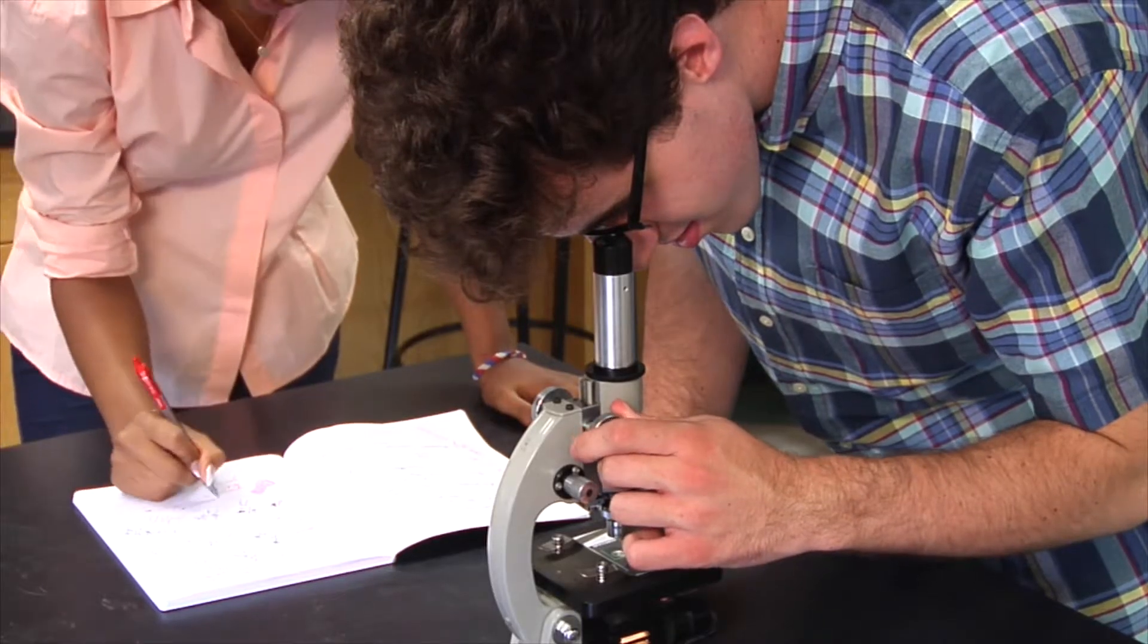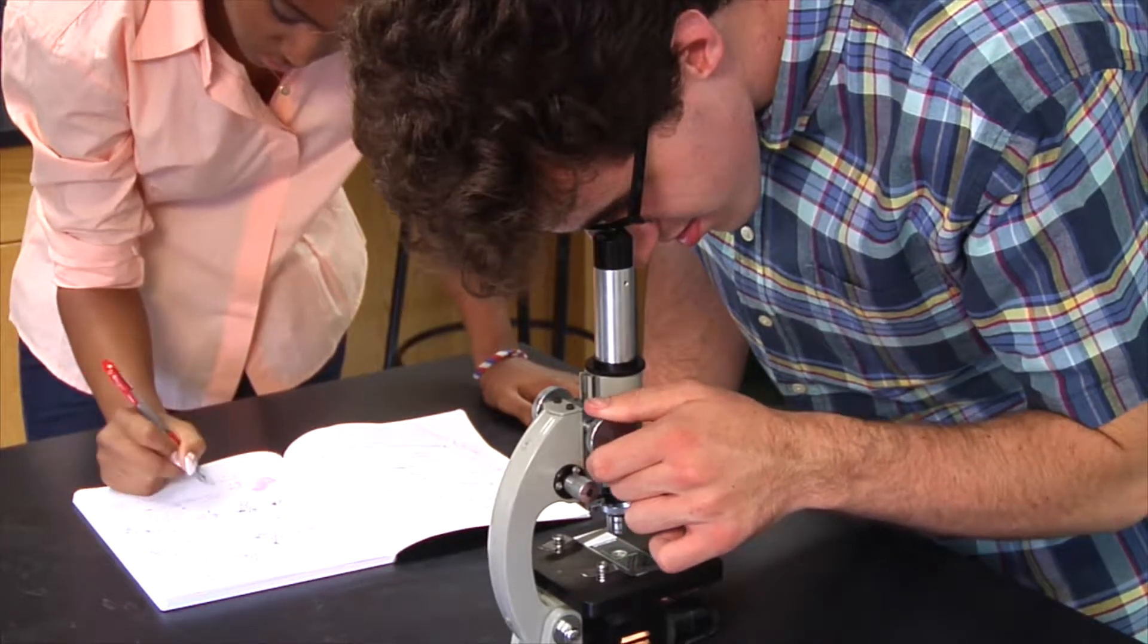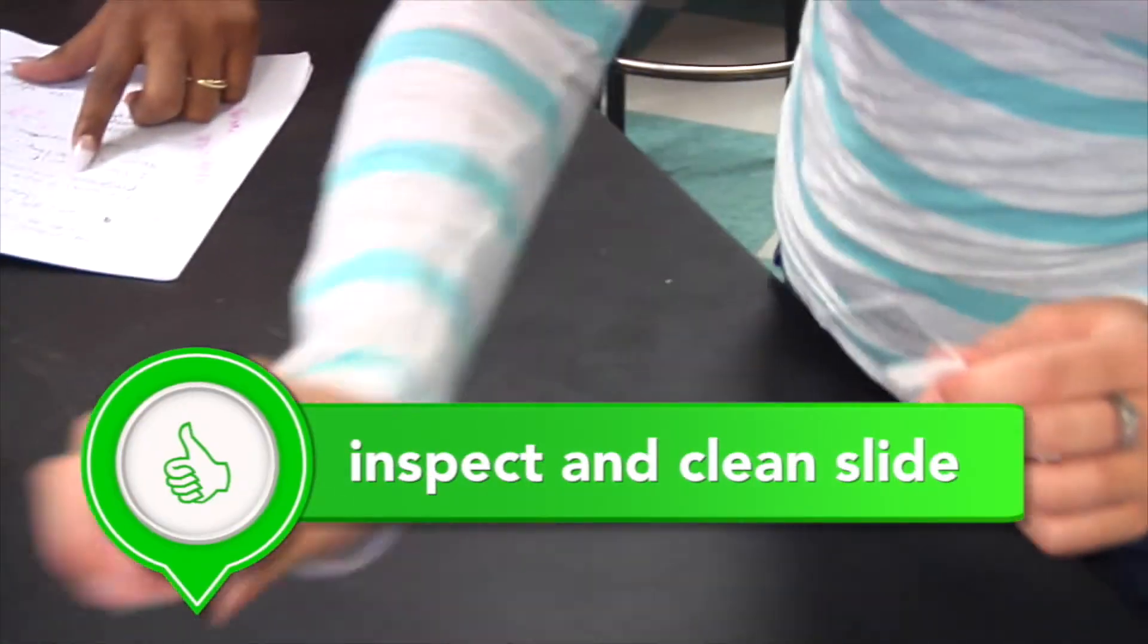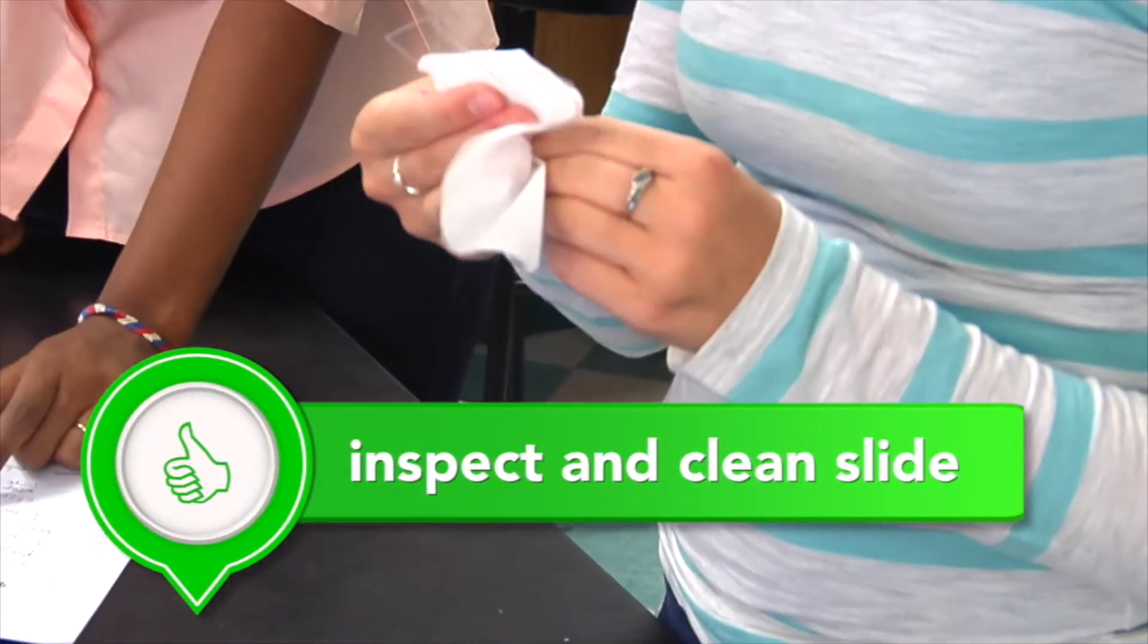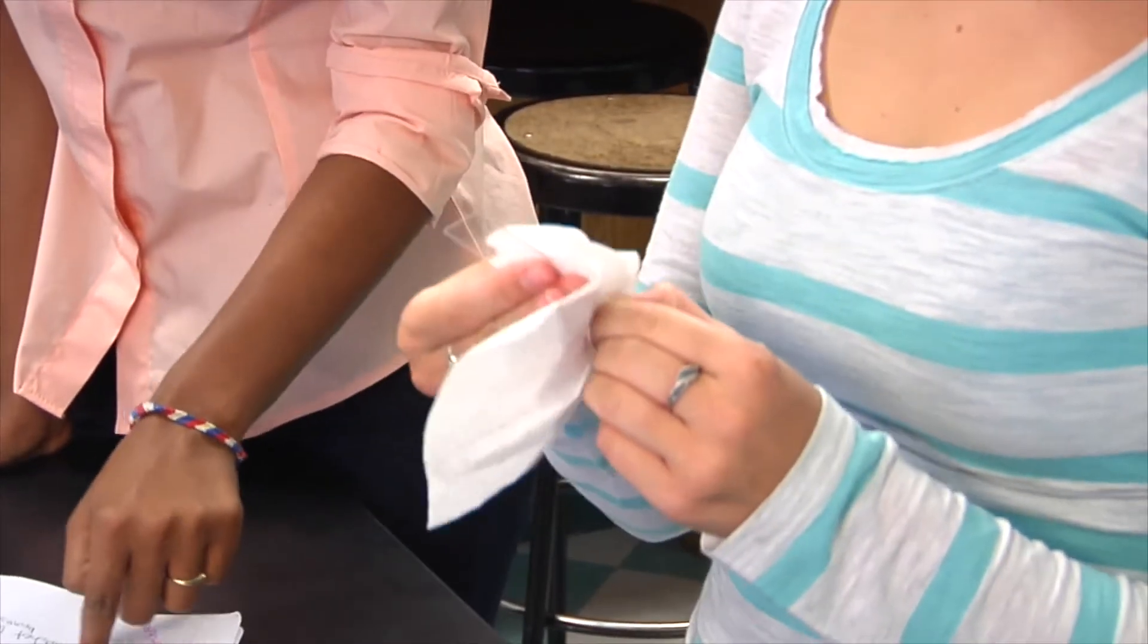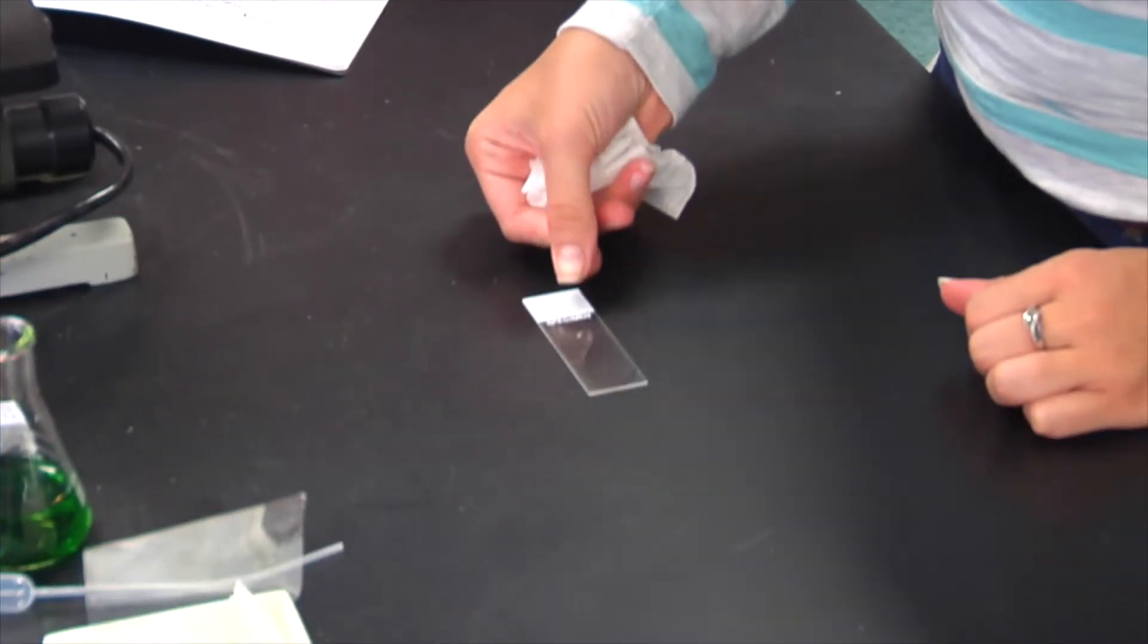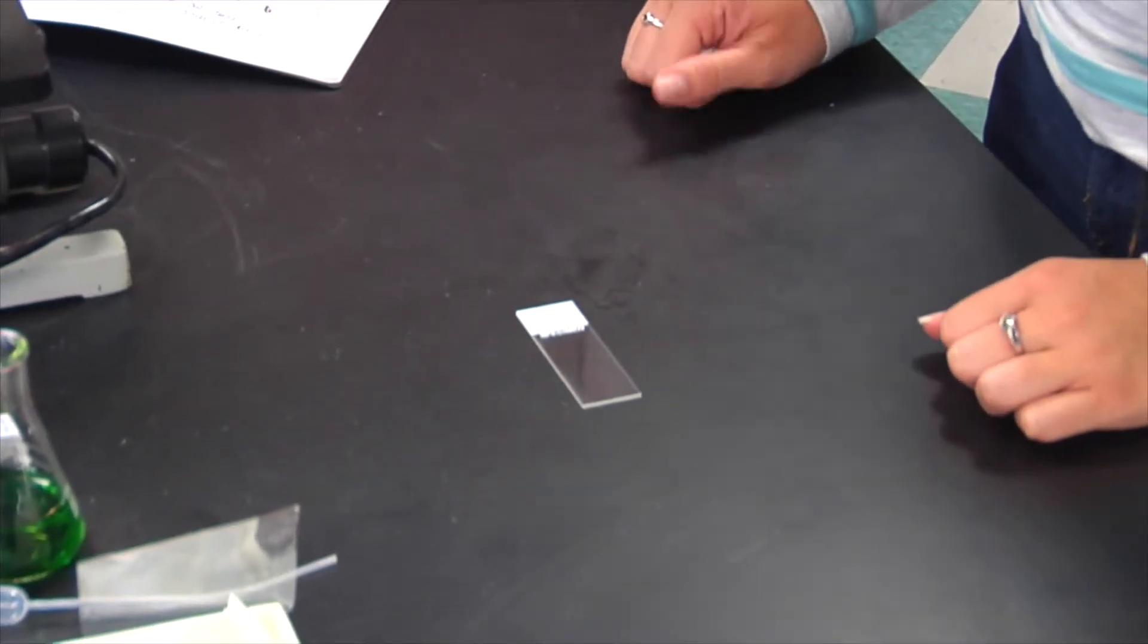First, let's consider how to prepare a microscope slide properly. Take a glass microscope slide from its box and inspect it for fingerprints or other debris. You pick up a slide by its sides to avoid putting fingerprints on it. If the slide is not perfectly clean, dirt or debris can interfere with the viewing of the specimen.